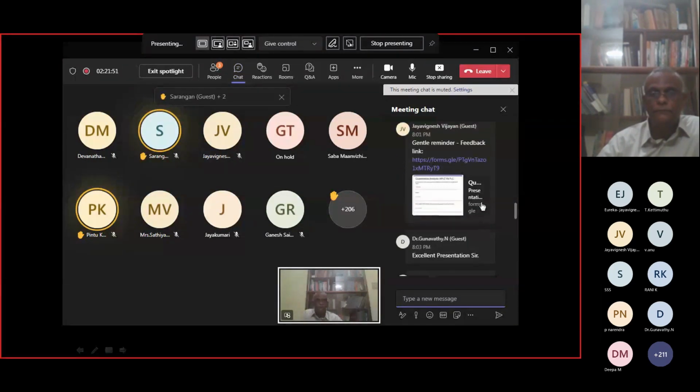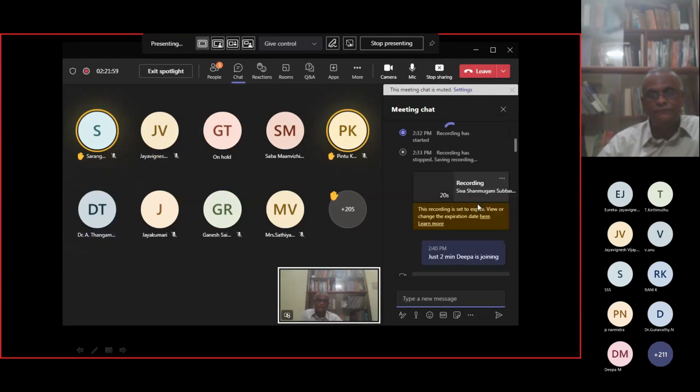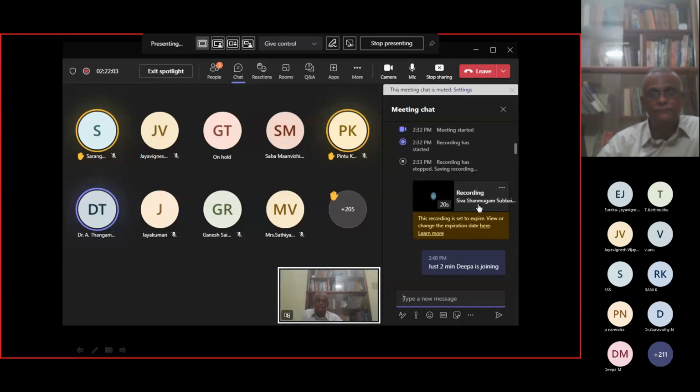Sir, I have one doubt actually. Yes, tell me, Dr. Tangamani. If you talk about TLC and HPLC, for some imported material, if we say that HPLC and TLC have the same accuracy, what is your opinion about that? When we do TLC, we do it in our laboratory only. We do not get any reports actually, we have only photographs. But for HPLC, we generate the report, whereas our user will ask about purity, and we will send the report, right? So what about that, sir?